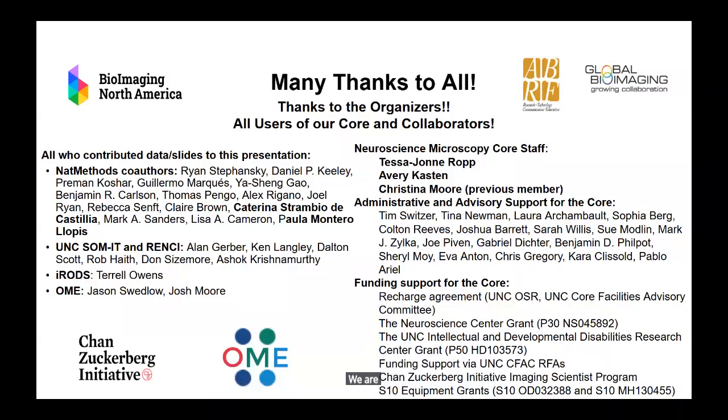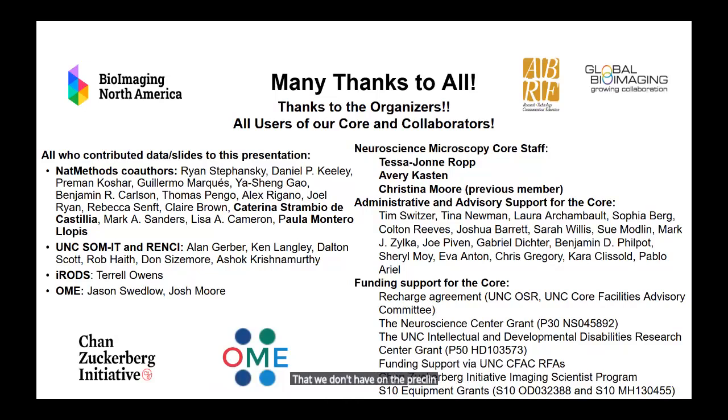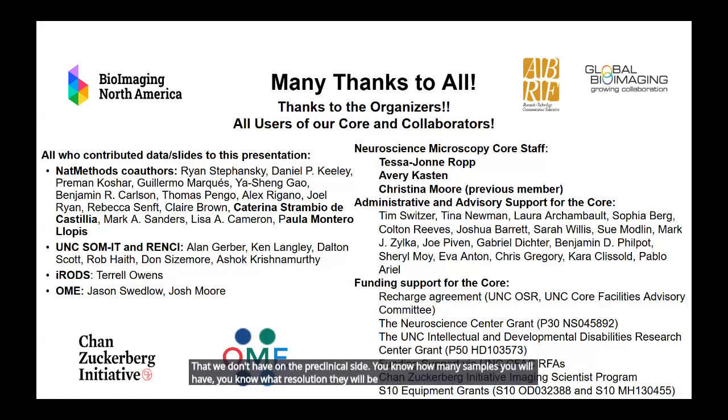We are talking about making a clinical data Omero, and what I would say is NYU has made one, and multiple others, and they actually find that it's easier because you have, going in, a project scope that we don't have on the preclinical side. You know how many samples you will have, you know what resolution they will be, and you can map them to a pre-made spreadsheet. Whereas with our preclinical researchers, they have no idea. They don't even know what microscope they're going to use yet. So it only grows, whereas the other one is more contained. But there are Omero instances that are clinical data.